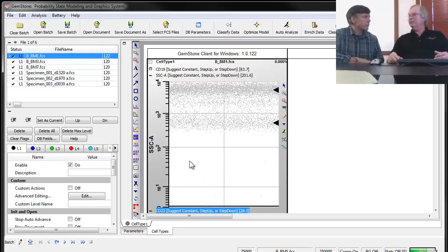This is something that we've done on a number of models, and so I'll show you this strategy right now.